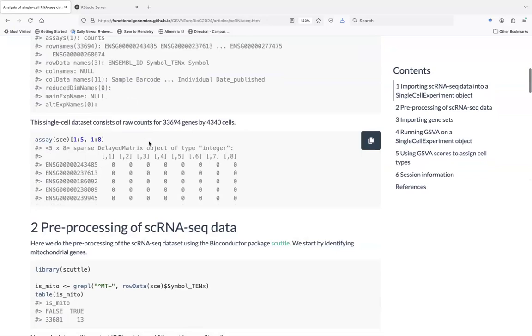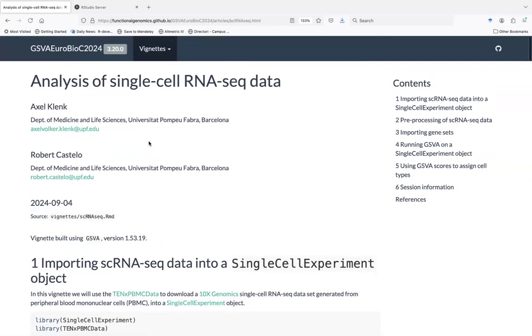Was that tested without trend? Limma no trend. Limma no trend is when you don't use the trend argument. When you don't use it, it's the classical limma. And the difference is that, according to Gordon Smyth, the author, you increase a little bit the statistical power. Depends on the data. In this particular example, it's negligible. You gain two different expressed pathways or something like that.